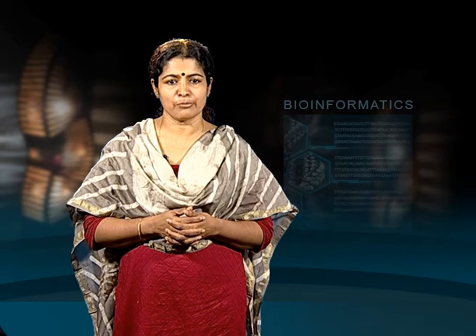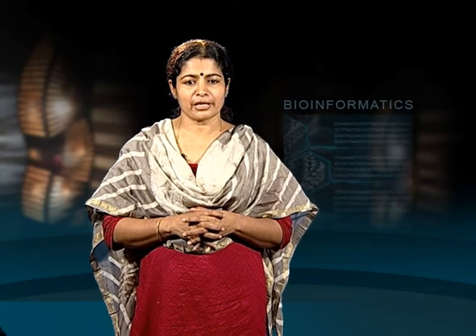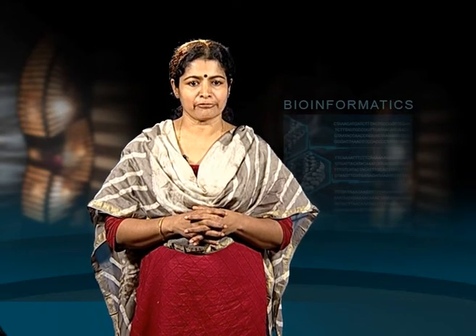Transcription factor binding analysis. Microarrays have also been used in combination with chromatin immunoprecipitation to determine the binding sites of transcription factors. In this, transcription factors (TFs) are cross-linked to DNA with formaldehyde and the DNA is fragmented. The TFs of interest are affinity purified using either an antibody to the TF or by tagging the TF with a peptide that is amenable to affinity chromatography, for example, a FLAG, His, MYC or HA tag.